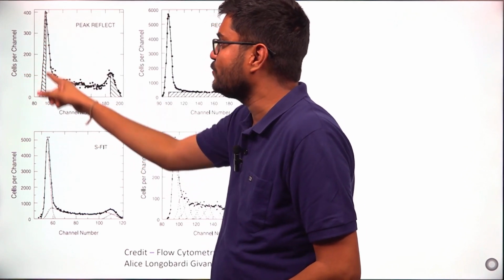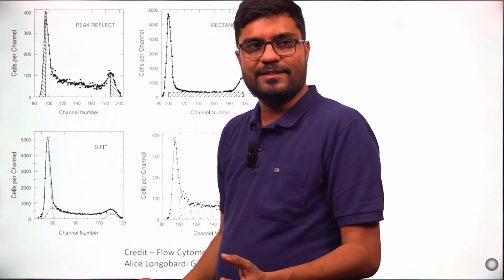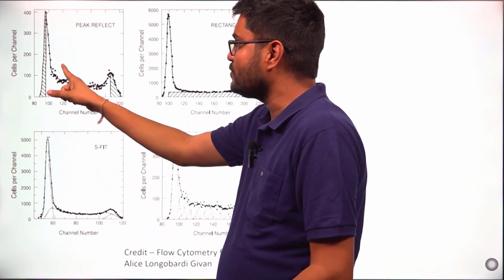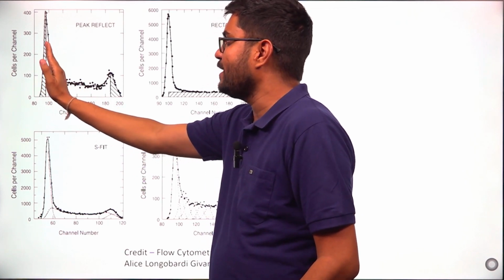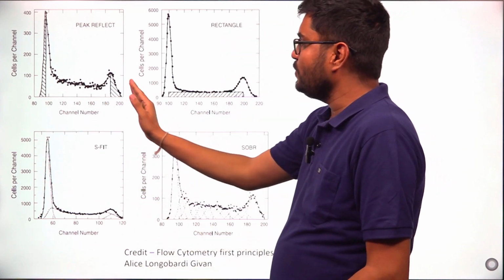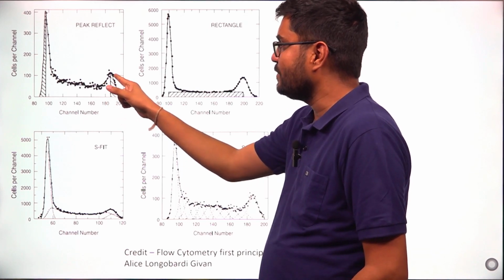and calculating the area on the left side of that mode line. So the central line is for the mode and we have the area on the left. Then the system makes a mirror image of this left area towards the right also. So the similar amount will be selected on the right, and then the area under the curve will be calculated. For G2, the mode is calculated, the central line, the highest number of cells.